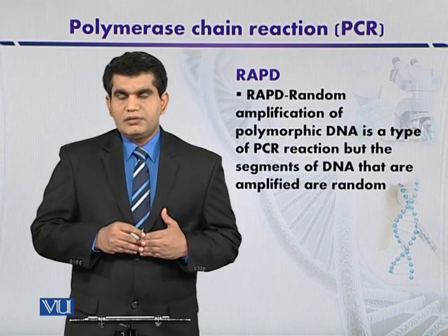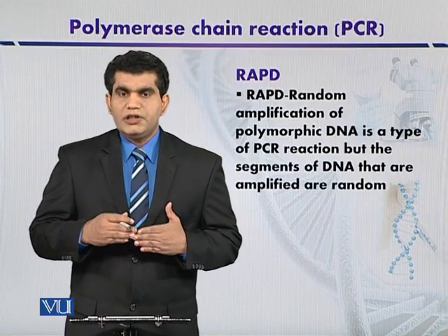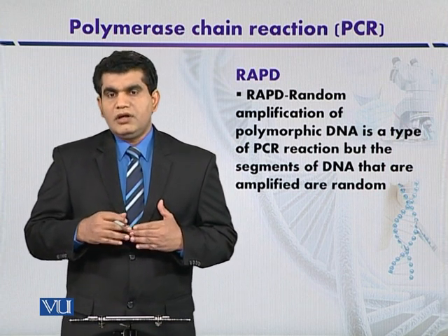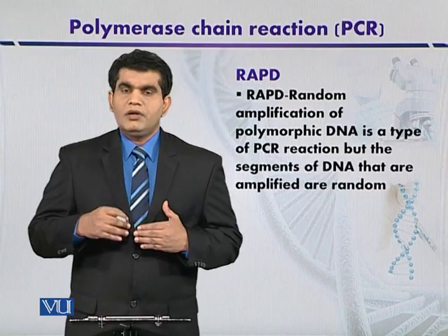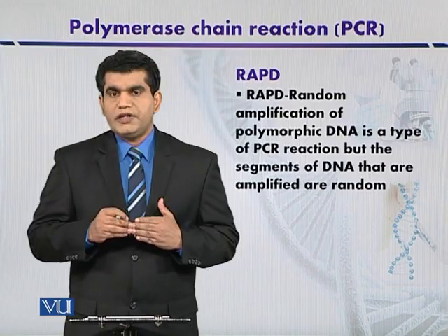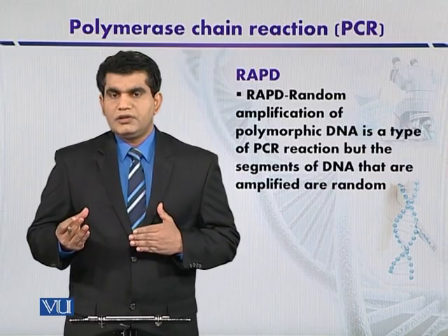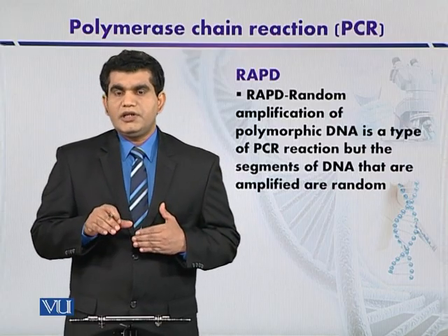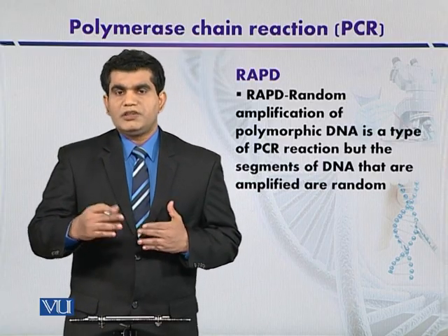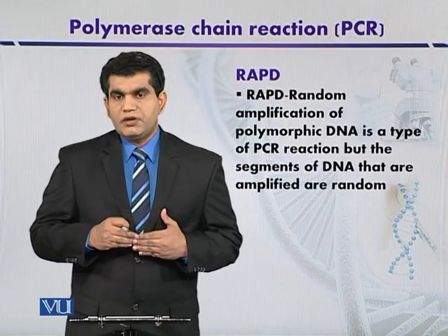Although it was initially thought that this technique is a very good way to find evolutionary relationships, it has certain limitations. The first limitation is that it cannot differentiate whether the amplified allele is homozygous or heterozygous. Secondly, the basic reaction conditions, like the enzymatic conditions, components of the PCR reaction, and template DNA concentration, can also influence the quality of the PCR.